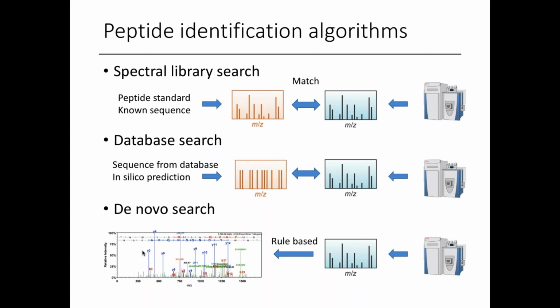The advantage of de novo search is that, obviously, you don't need any sequencing data. Although it's not very hard to get nowadays, some of it is still not so easy to get, like for the microbiome and other areas like metaproteomics. However, de novo search is still, I think, in an early stage, so the accuracy is still not comparable with the database search.